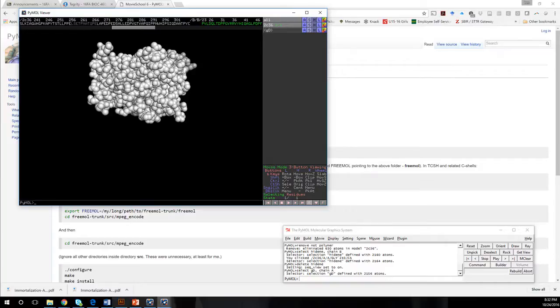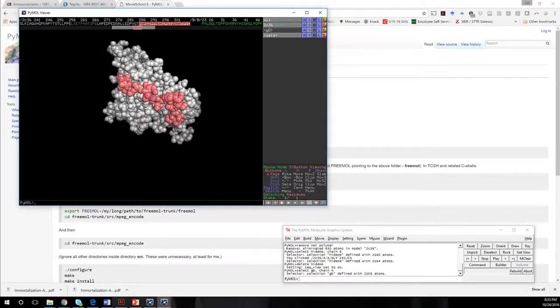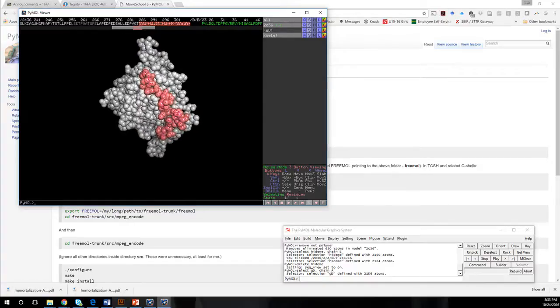about 285 through 306, just so that I have a frame of reference, because that's what I use a lot of. So I'm going to make it deep salmon, and then I know where that's at, and I have a frame of reference to what I'm looking at, because otherwise I struggle a little bit with what I'm looking at all the time. And this might be upside down, but I at least know where I'm at.